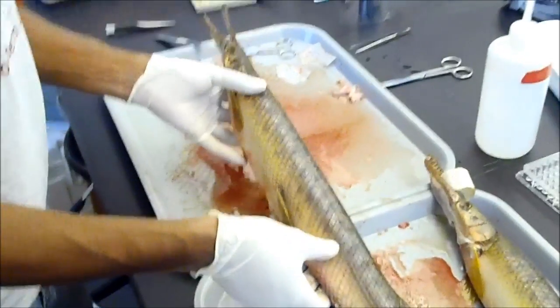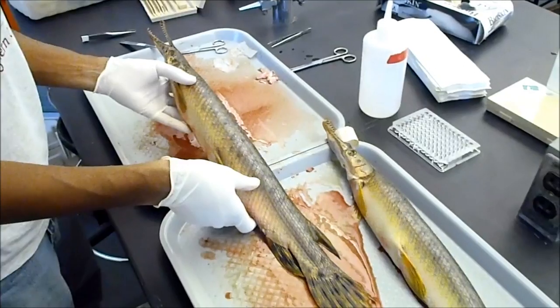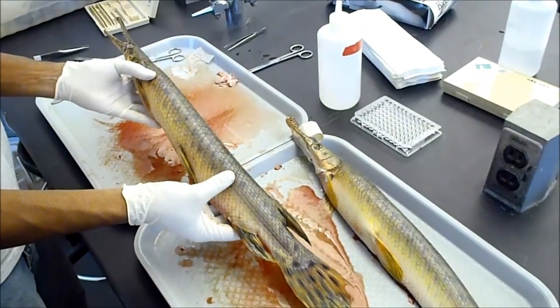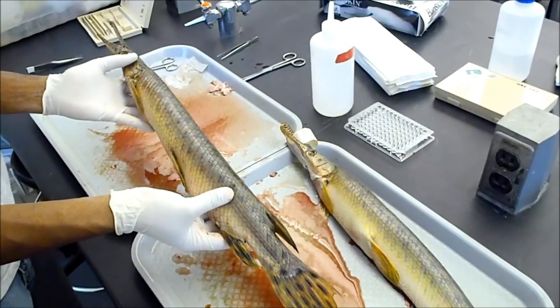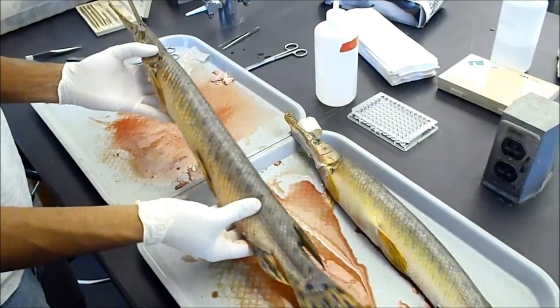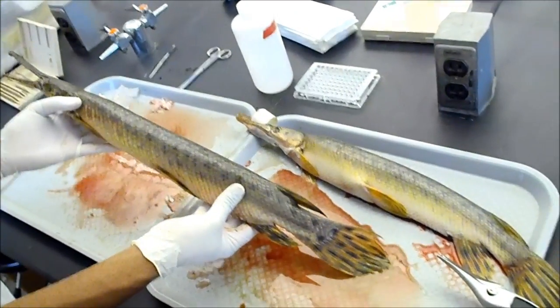Now we're going to dissect specimen number two from Van Oaken Lake. We would probably expect this to be a male — it's kind of intermediate in size, small for a female, maybe average to large size for a male. This is a 64-centimeter long specimen.